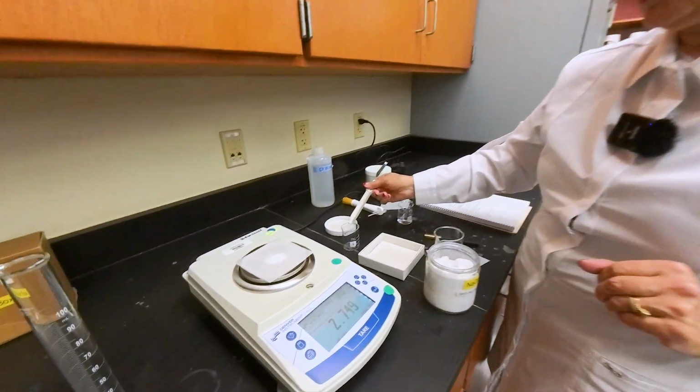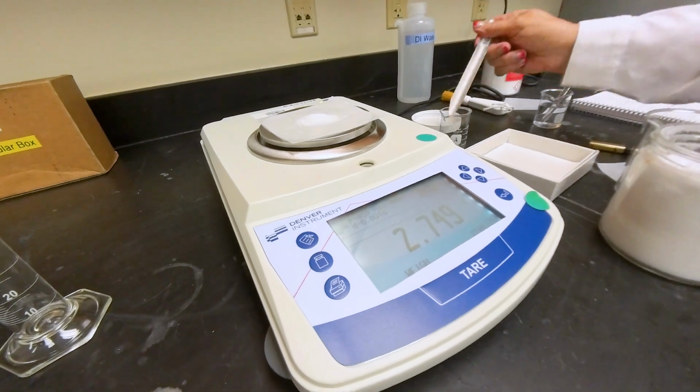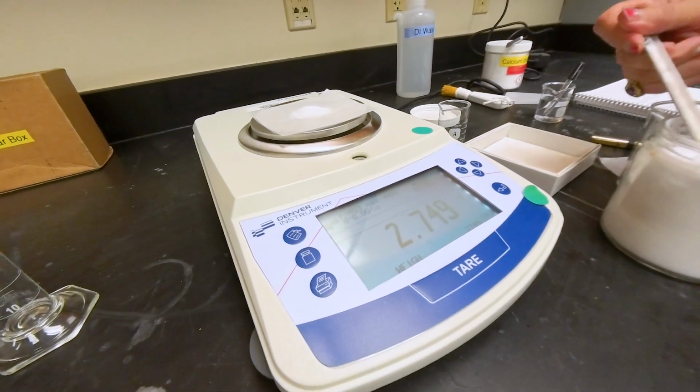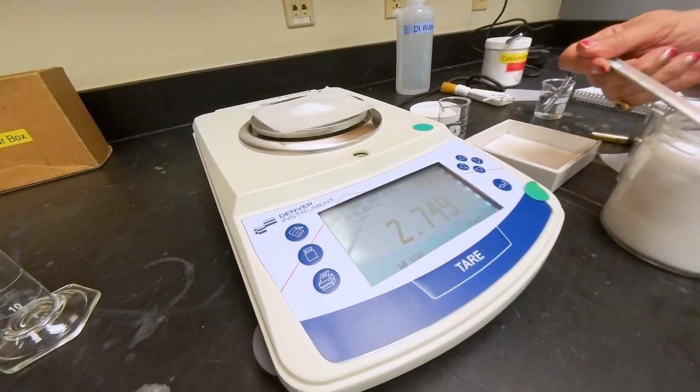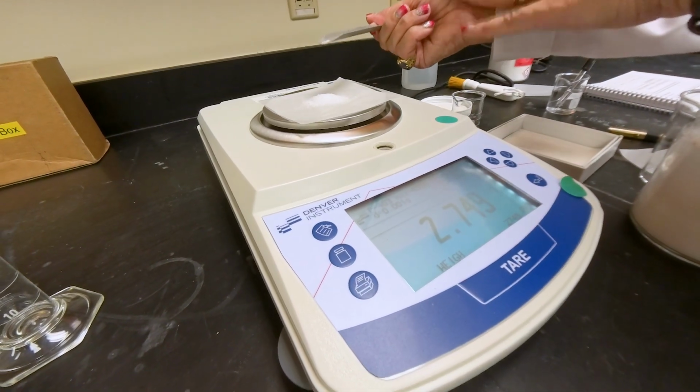Okay, so we have 2.750. It moved back down to the 9, so I need another grain.